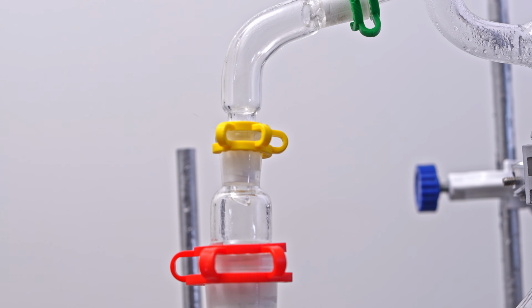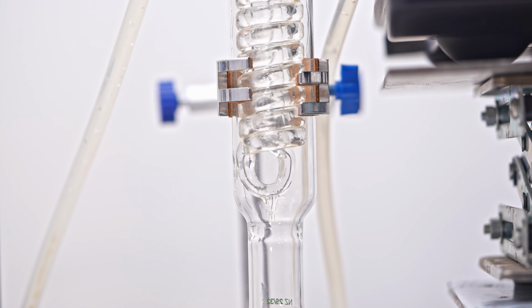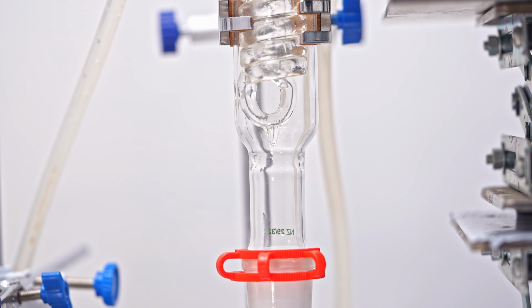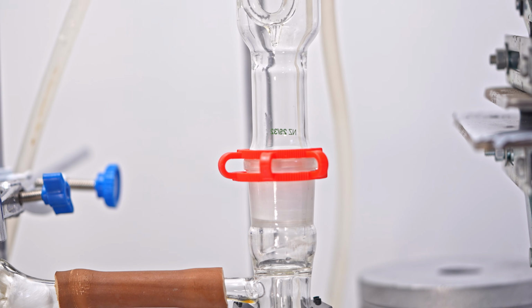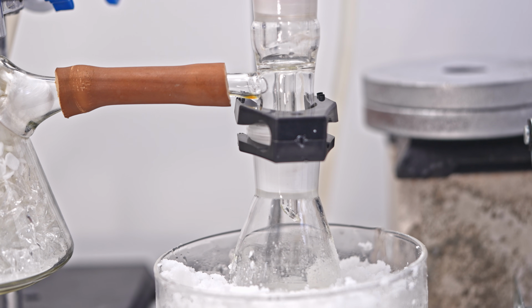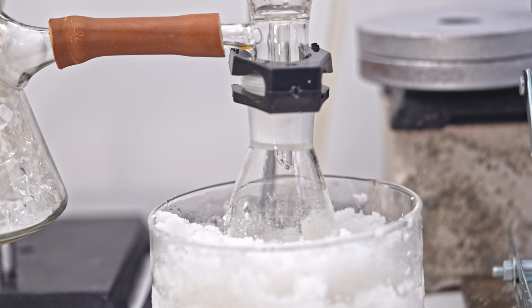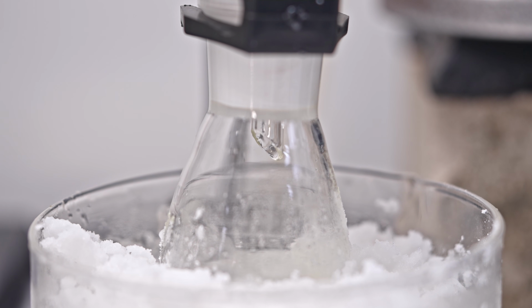However, I decided to use a water bath anyway. The nitric acid distills at slightly below 25 degrees Celsius as a clear liquid. Take a look, unlike the previous synthesis where we used ordinary distillation and the acid turned out yellow, this time it distills as a perfectly colorless liquid, just the way pure anhydrous nitric acid should look.